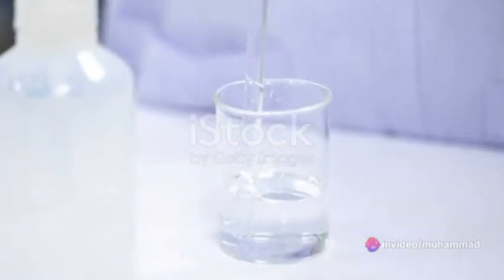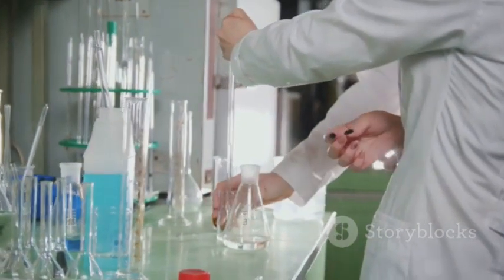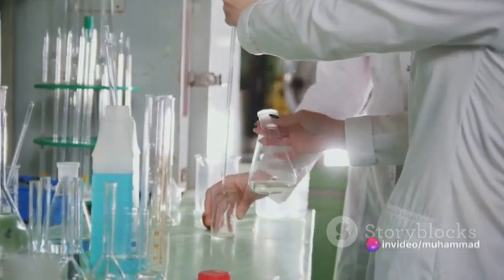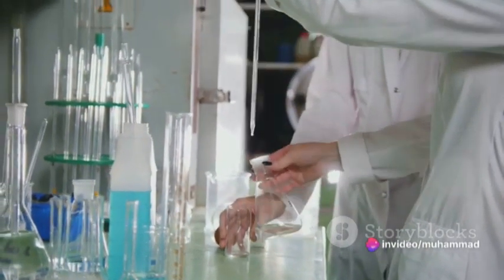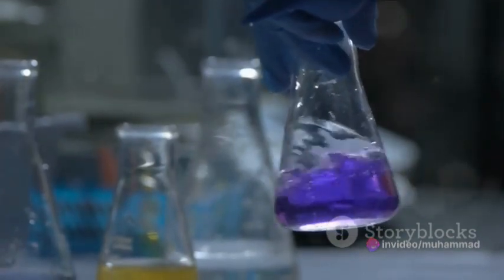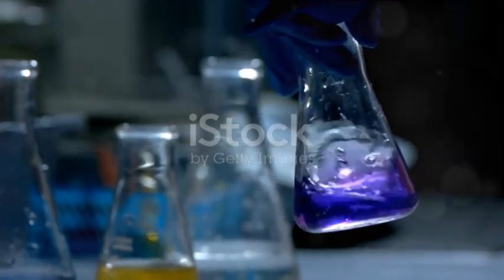To sum up, acid-base titrations are integral to various fields, from medicine to environmental science. They involve a carefully measured dance between a known solution and an unknown one, with an indicator acting as the maestro, signaling the end of the performance. The end of the titration is marked by the change in color of the indicator, signifying that the unknown solution's concentration has been determined.